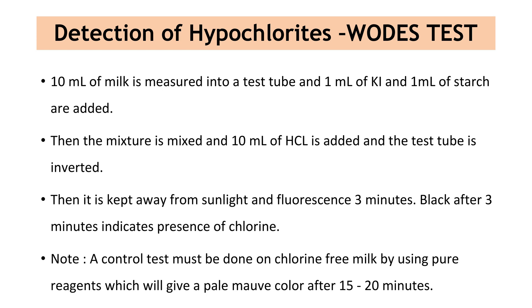Last but not least, let's see how to detect hyperchlorides. For that, 10 ml of milk is measured into a test tube and 1 ml of potassium iodide and 1 ml of starch are added. Then the mixture is mixed and 10 ml of HCl is added and the test tube is inverted. Then it is kept away from sunlight for 3 minutes. Black color after 3 minutes indicates presence of chlorine. A control test must be done on chlorine-free milk using PO reagents, which will give a pale mauve color after 15 to 20 minutes.